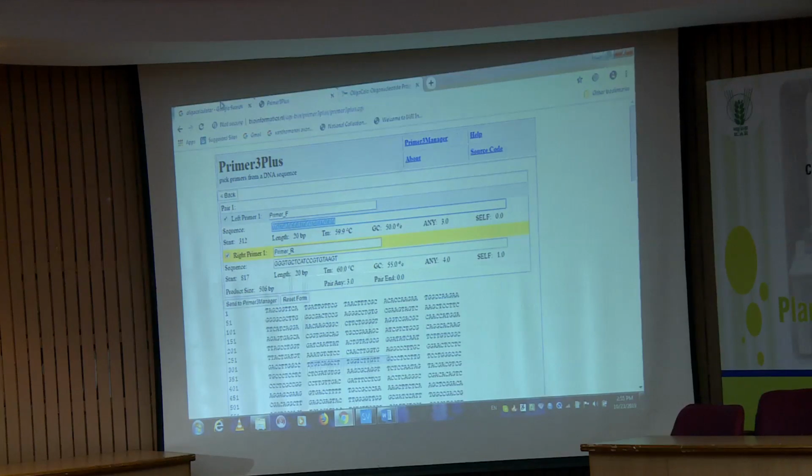Those universal primers we use are picked because the sequence is conserved among the bacterial species and genus, and the species is then identified based on the variation in that particular amplicon, correct? Any other questions?